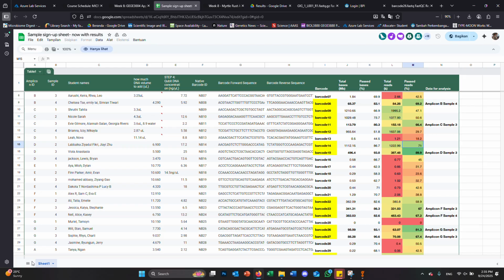I think all of our DNA concentrations were detectable. Every single sample had some DNA there, so you didn't lose your DNA. But if the DNA doesn't have the A-tail stuck on the end, it's not going to be barcoded properly. So there's a possibility that the A-tail step didn't work. Or there's a second possibility that the A-tail step worked and the barcodes didn't work. Maybe there wasn't enough ligase, maybe the conditions weren't optimal. Those are the two main areas where step 2 and step 5 would possibly have failed.